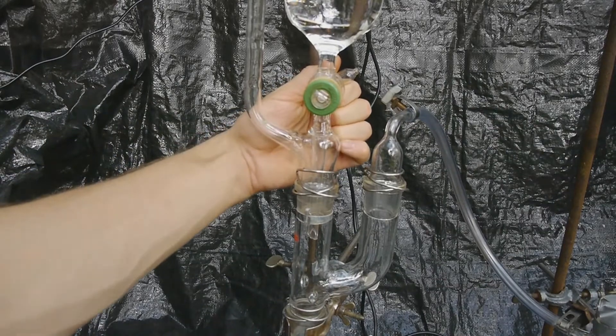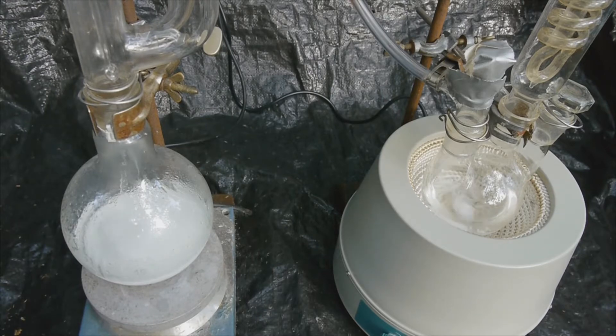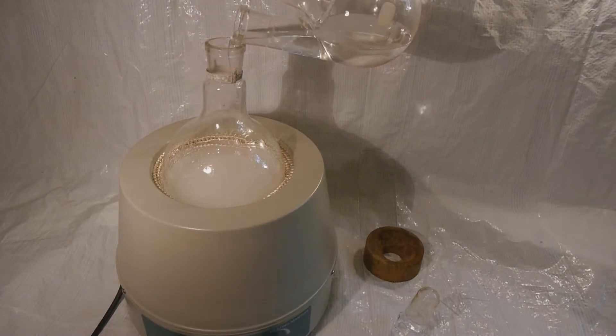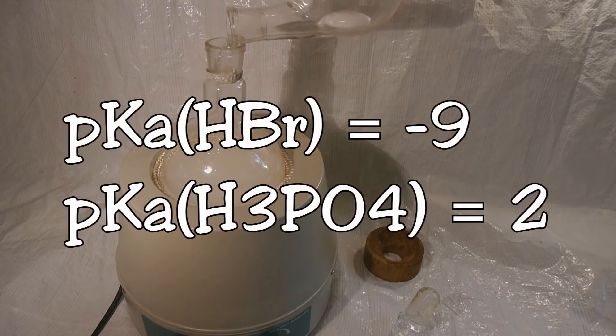Needless to say, this totally failed because the phosphoric acid completely refused to react with the sodium bromide, even at elevated temperatures. I tried to save the experiment by pouring the ethanol into the sodium bromide phosphoric acid mixture, but it also didn't react because the phosphoric acid is 11 orders of magnitude weaker than the hydrobromic acid.